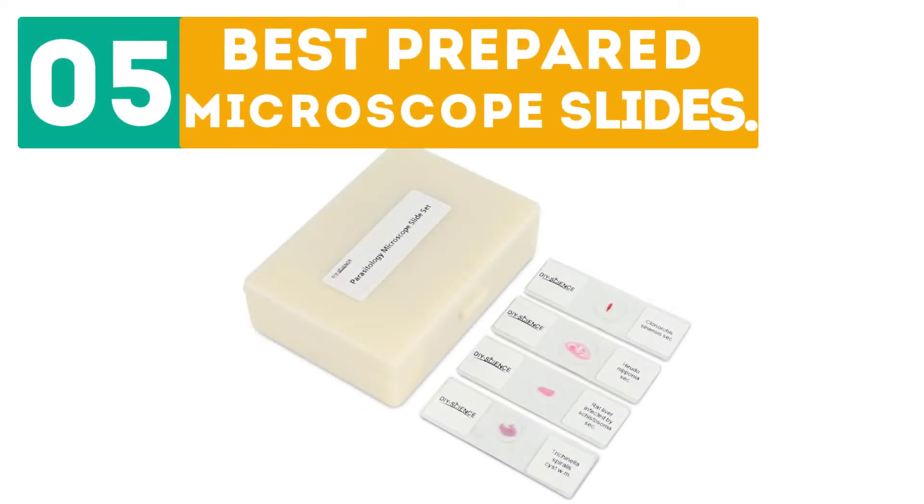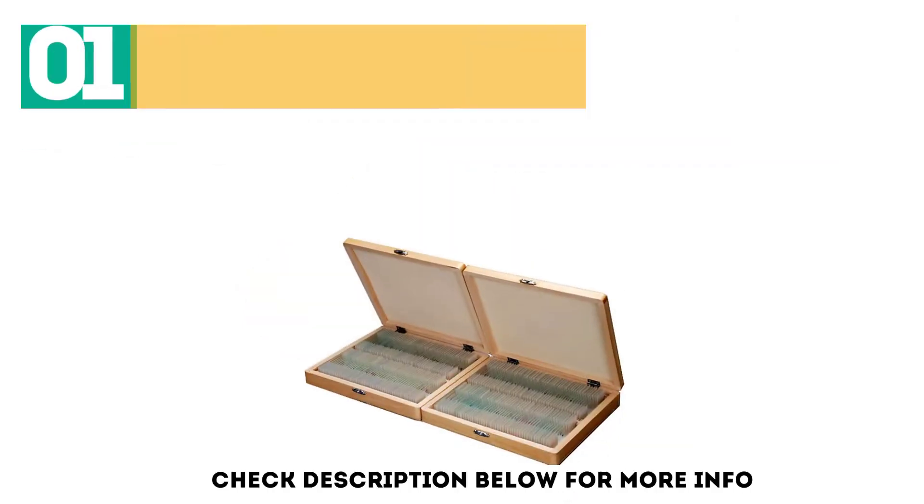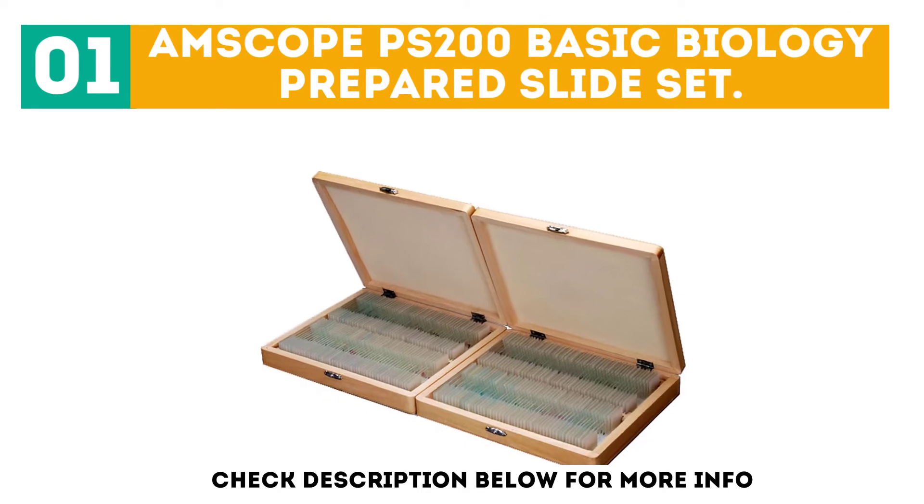Gabor presents the Top 5 Best Prepared Microscope Slides. Let's get started with the list. Starting off at number 1: M-Scope PS200 Basic Biology Prepared Slide Set.